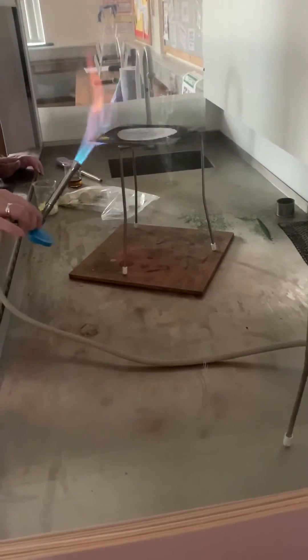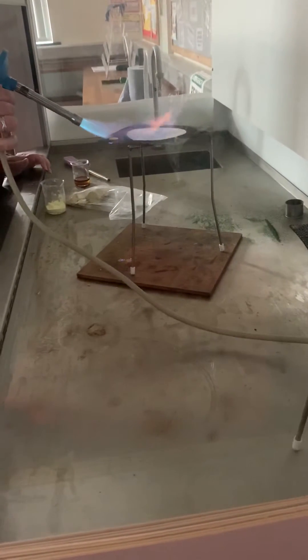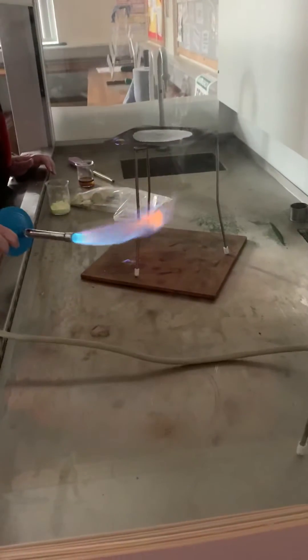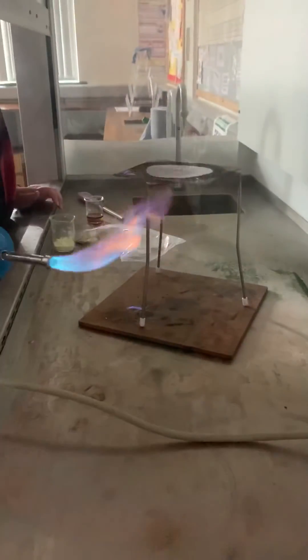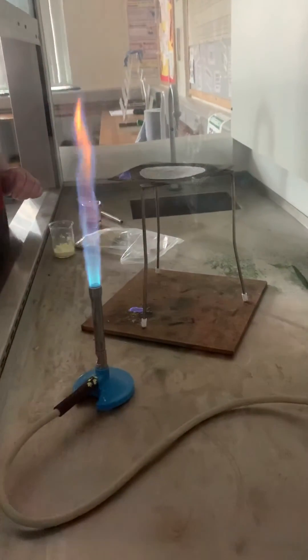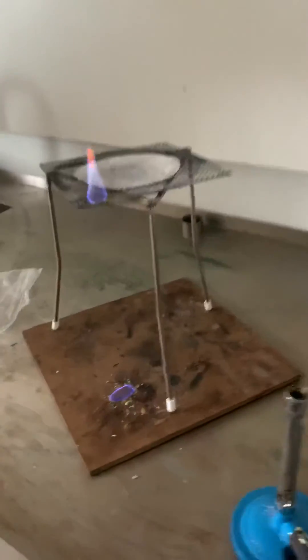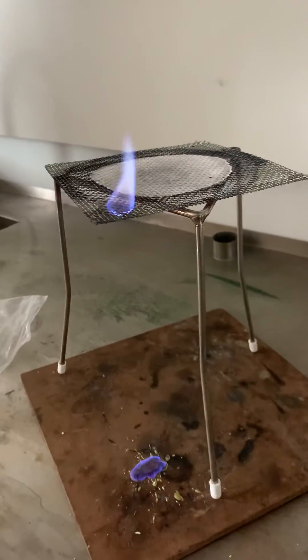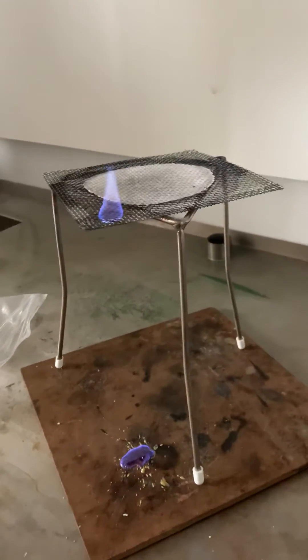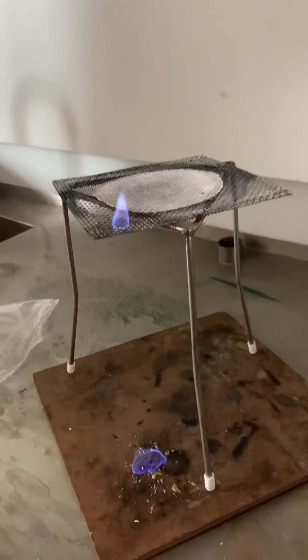See the blue flame there? See the bit that's dropping through? You can see the blue flame on the safety mat. There's a blue flame on the gauze and also a little blue flame on the safety mat. And that's just sulphur burning with a blue flame.